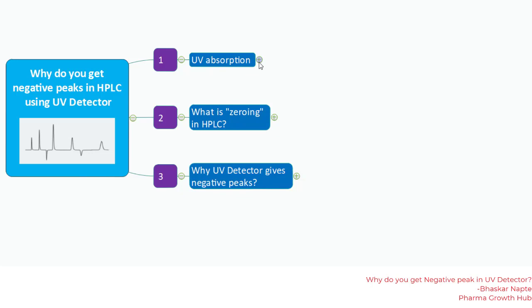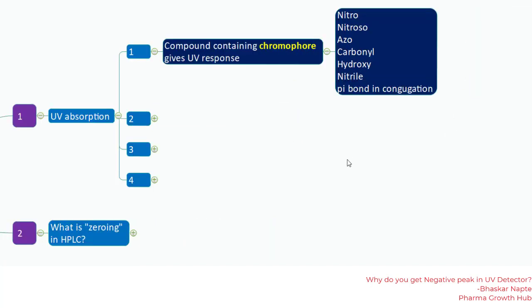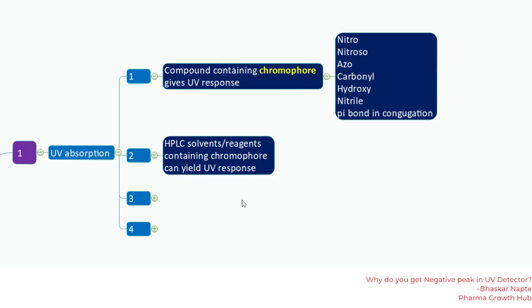The first point is UV absorption. A compound can have UV absorptivity if it contains chromophores. Examples of chromophore groups include nitro, nitroso, azo, carbonyl, hydroxyl, nitrile, or if there is a pi bond in conjugation — your compound can give absorbance in the UV range, for example from 200 nanometers to 400 nanometers. HPLC solvents or reagents containing chromophores can also yield a UV response, which becomes a point of concern because you do not want a response from the diluent you are using.